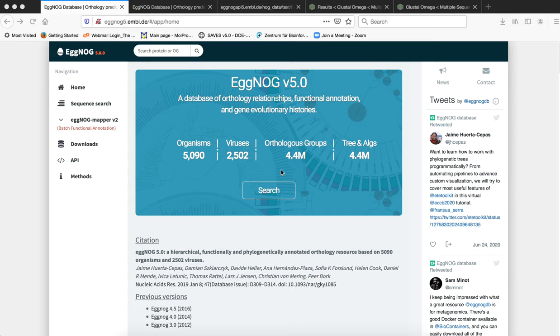One of the other most important servers for analysis, functional analysis, characterization and annotation is the eggNOG database and eggNOG server, which allows for orthology predictions and functional annotation of a protein sequence or a set of protein sequences.